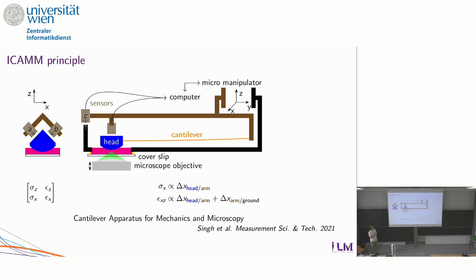Here it's a point, but a line between air, a solid, and the gel, which is mostly water. So this will be terrible, because you'll have triple line anchorage there. And basically those interfacial forces will completely dominate the kind of measurement you would be doing. So we immerse everything. To be quick, I would say we immerse everything in the same solvent as permeating the gel. That's a bit more complicated than this, but here we are.